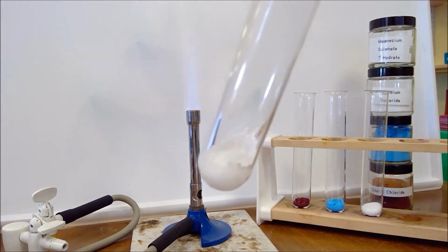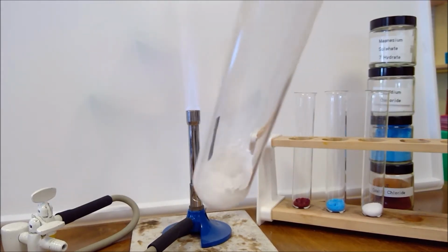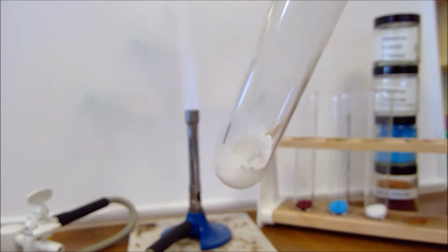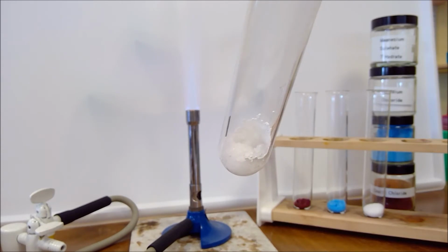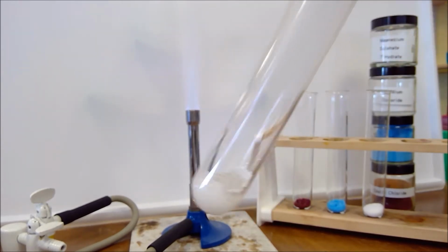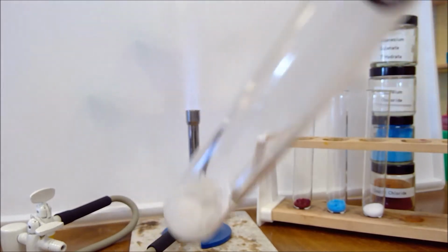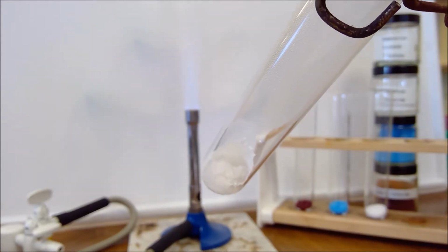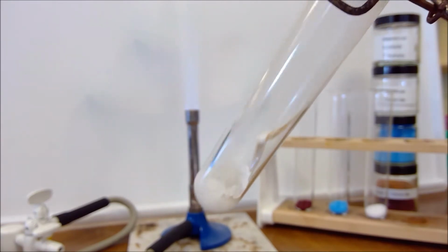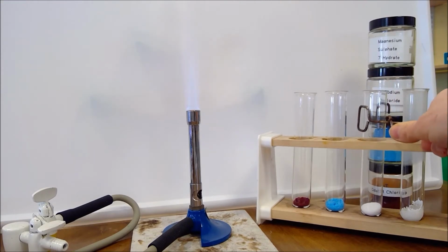And heating a little further here, we can see it looks like it's boiling. We actually get so much condensation out that the solid starts dissolving a bit in its own water of crystallization there. But certainly all the way up the tube here, we've got lots of condensation. So record the final appearance there. I'll pop that one down.